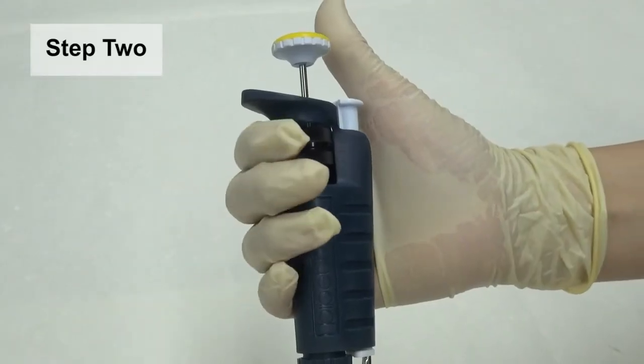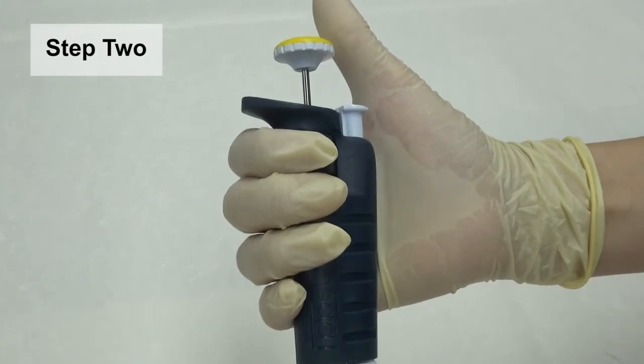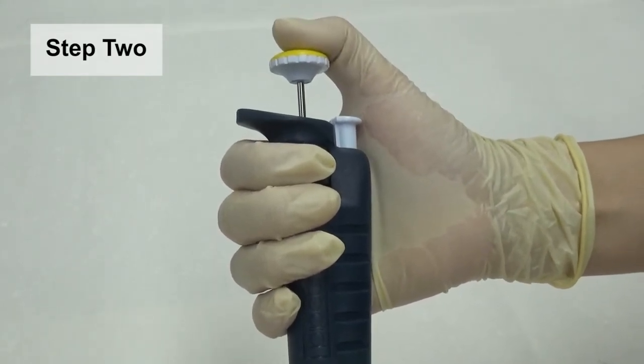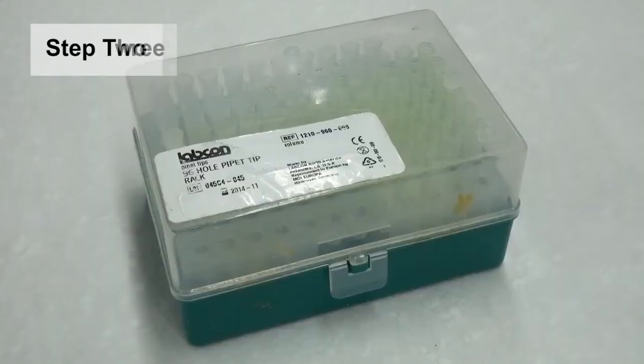Step 2. Please hold the MicroPipet with four fingers. Free the thumb to operate the operating button for aspirating and dispensing the solution.